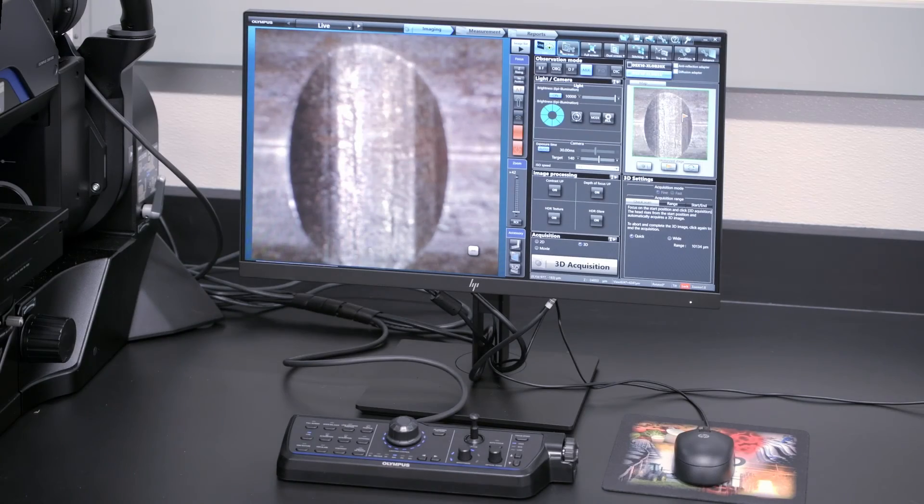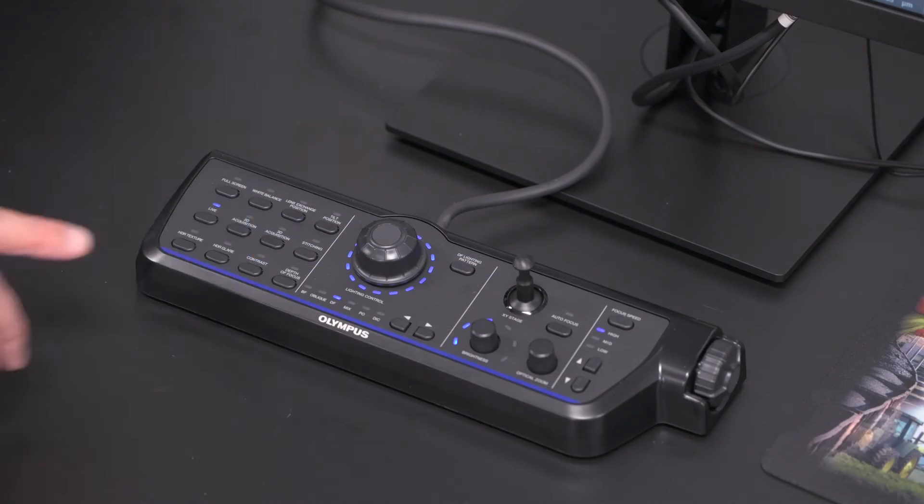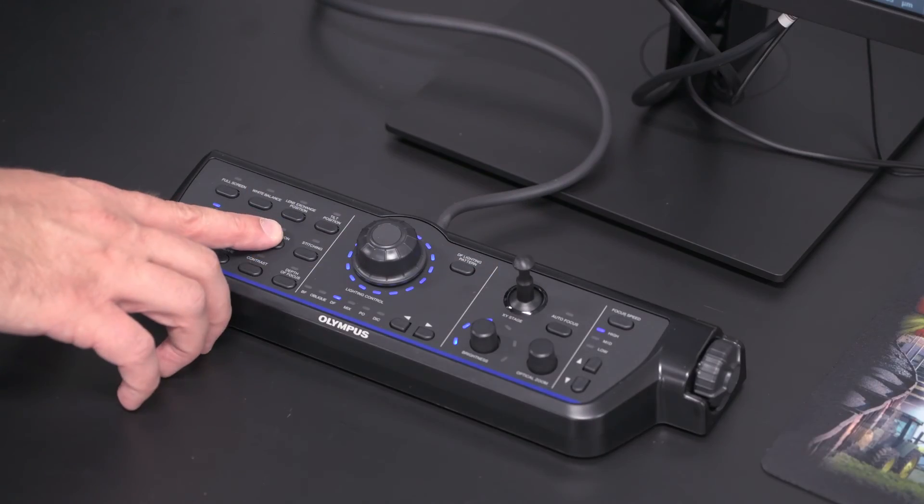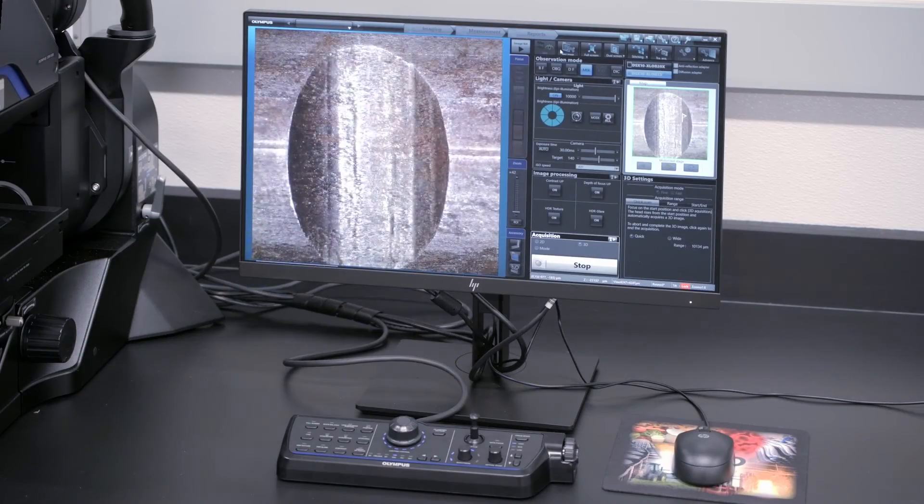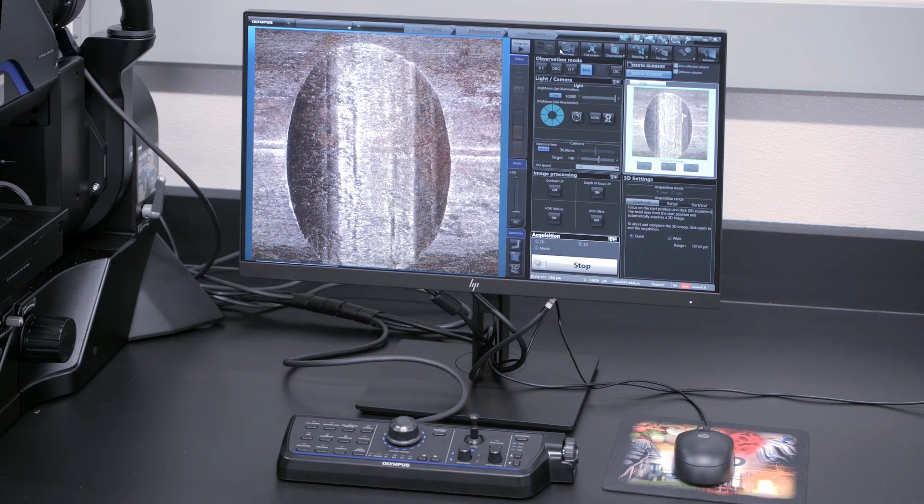3D acquisition with the touch of a single button is faster and easier than ever before.